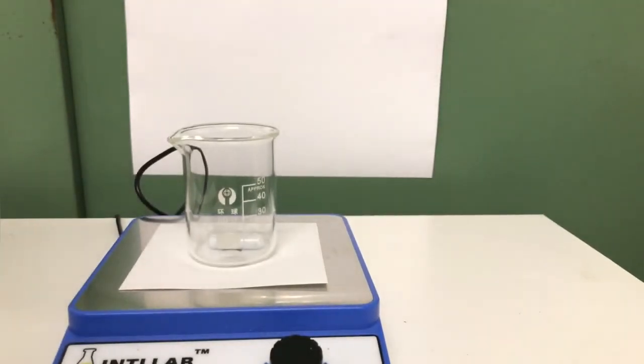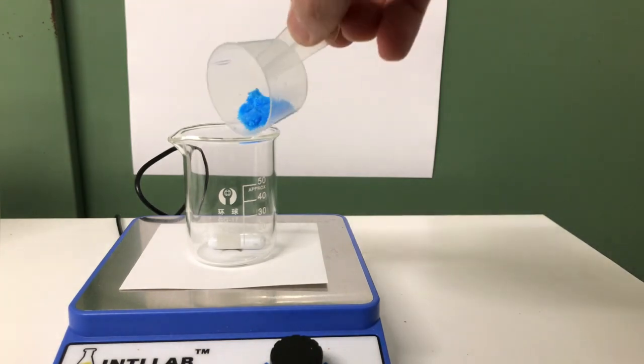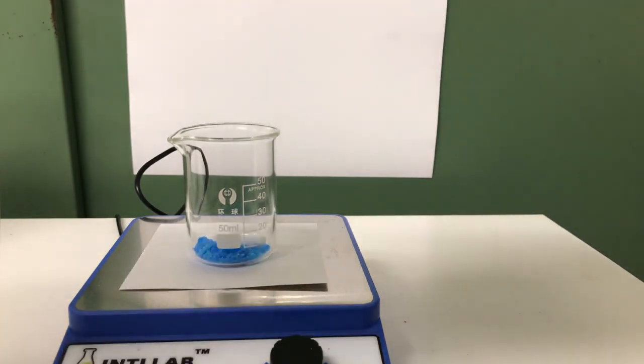Start by adding the copper sulfate into your beaker and afterwards dissolving it in some distilled water.